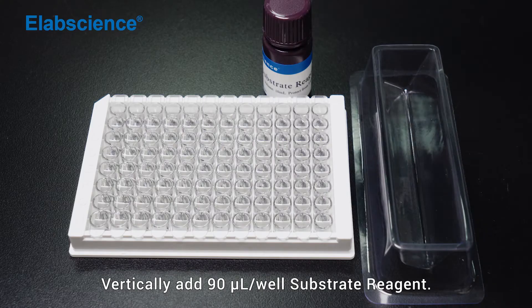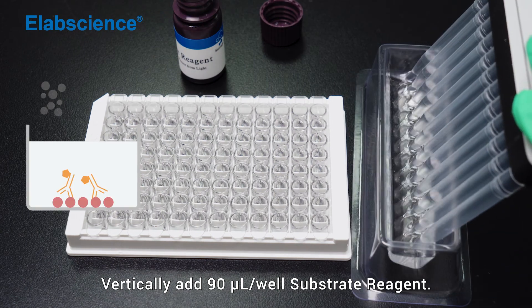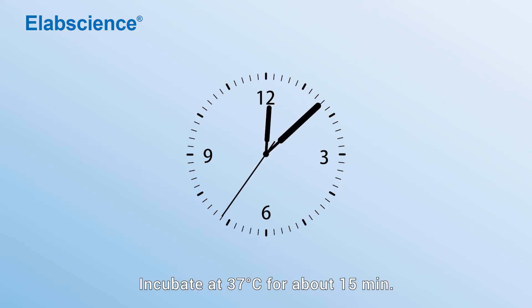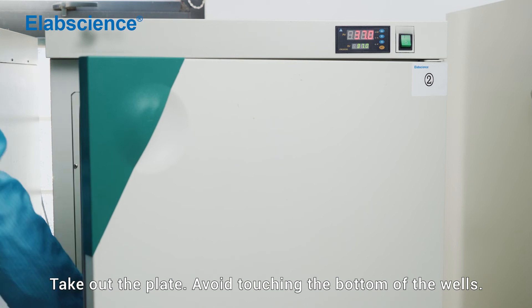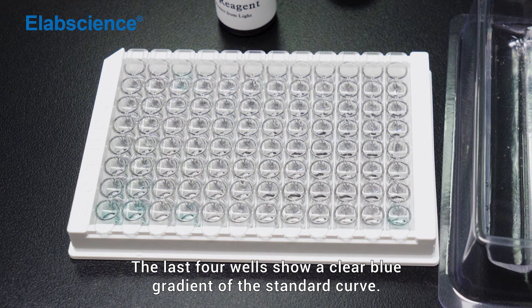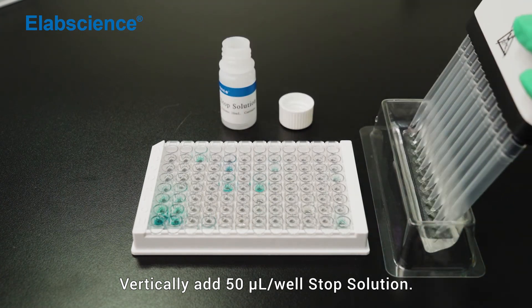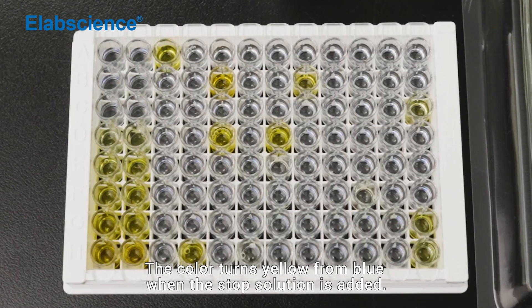Color development. Add 90 µL per well of substrate reagent vertically. Cover the plate with sealer and mark the name, time, and abbreviation. Incubate at 37 degrees for about 15 minutes. Take out the plate and avoid touching the bottom of the wells. The last four wells show a clear blue gradient of the standard curve. Reaction terminated. Add 50 µL per well of stop solution vertically. The color turns from blue to yellow when the stop solution is added.